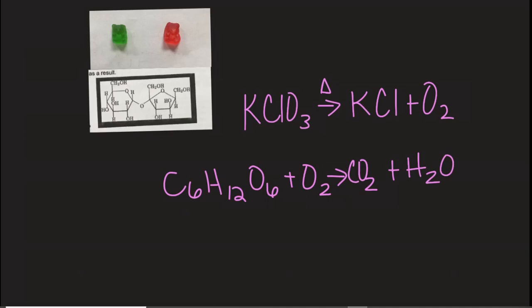And that's correct, okay? So basically what's happening is that gummy bears are mostly made up of sugar. Sugar is known as sucrose in organic chemistry, which is a disaccharide made up of two monosaccharide molecules. Now, I know that we haven't talked anything about those, but all that you have to know is that they're made up of glucose, which is indicated on this left-hand side, and fructose over here on the right-hand side.